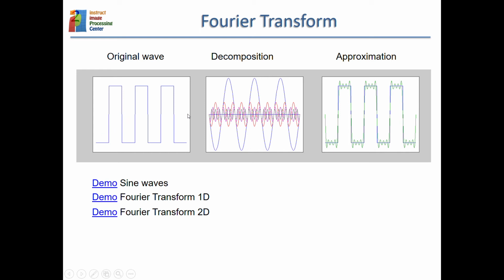So let's say that this is our input image that we have plotted in one dimension. So our black and white pixels, if you want. All these pixels would be white, all these pixels would be black, and then white again, and then black again. And we can understand this set of pixels as a sum of waves. We would have first a wave that follows more or less the general trend, going up and then down and then up. So this is exactly following the same periodicity.